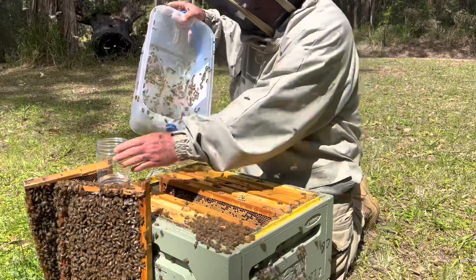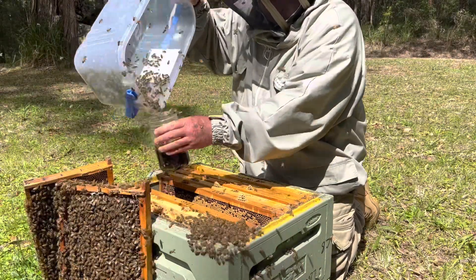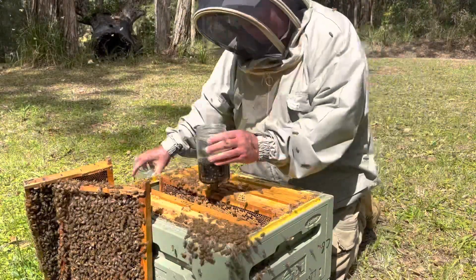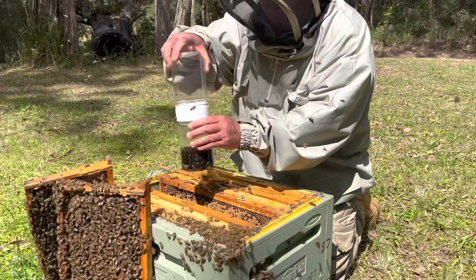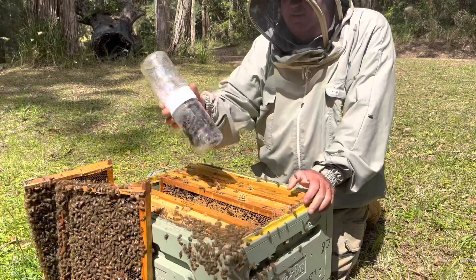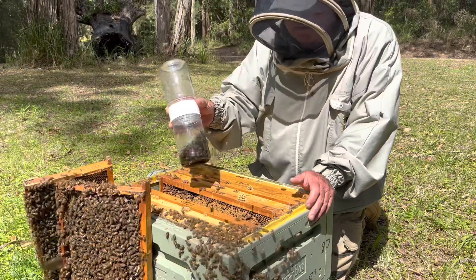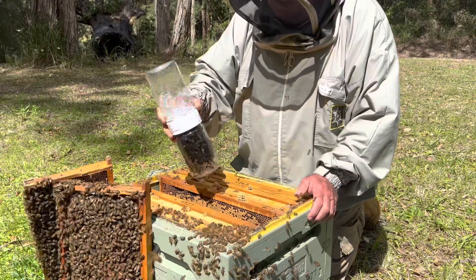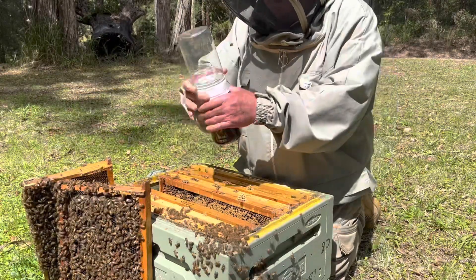Just get them into the corner of the tub and into the bottle. Shake the rest back in there and get the shaker back on. You need to shake that quite vigorously for four minutes — a really good hard shake. The idea is to dislodge the dead mites off the bees.